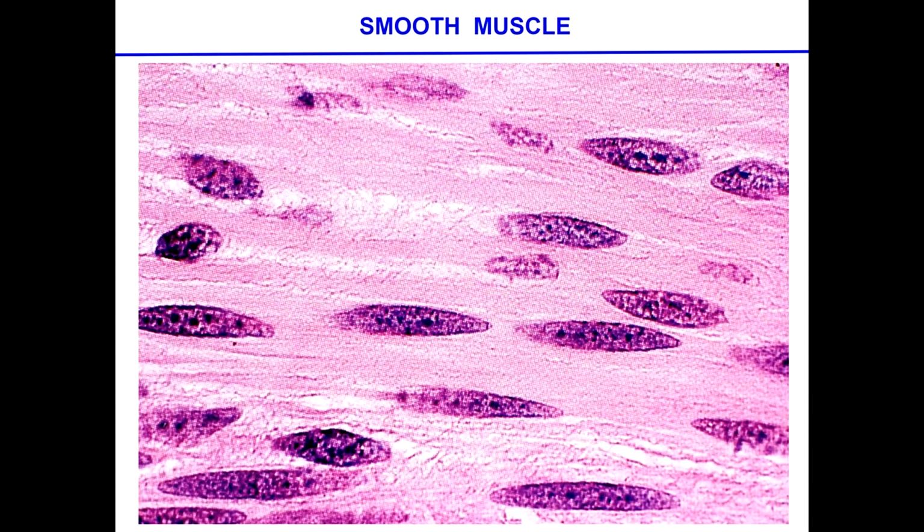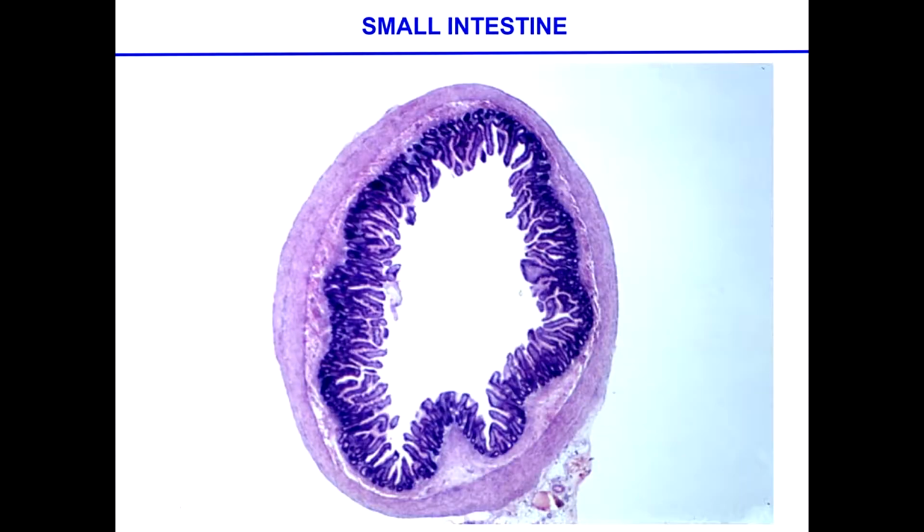Same tissue, lower quality picture, same idea: a longitudinal section of the muscle cells with the nuclei in the center. Questions? This is now a section of the entire small intestine.